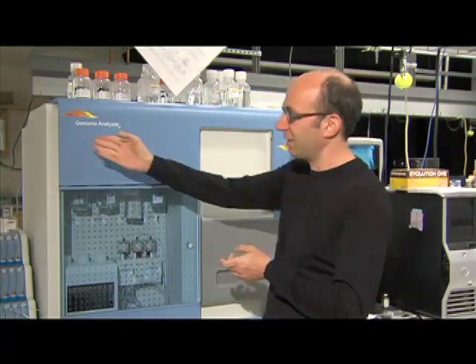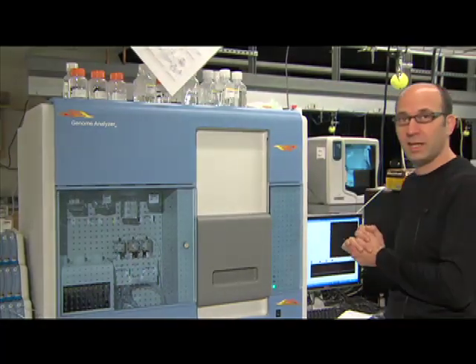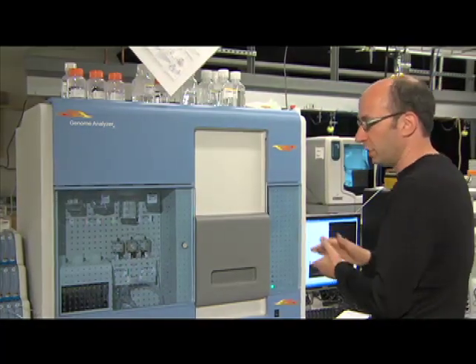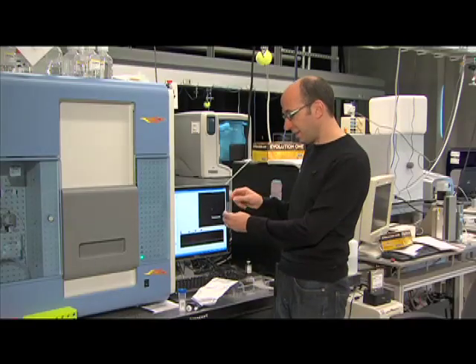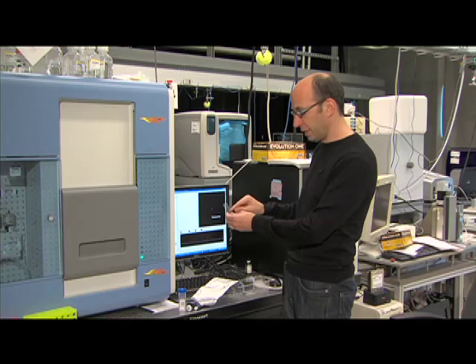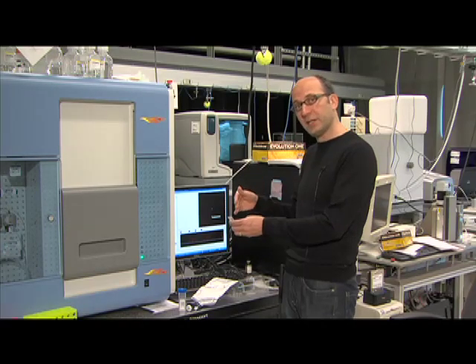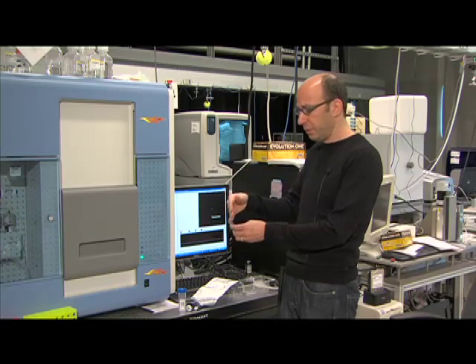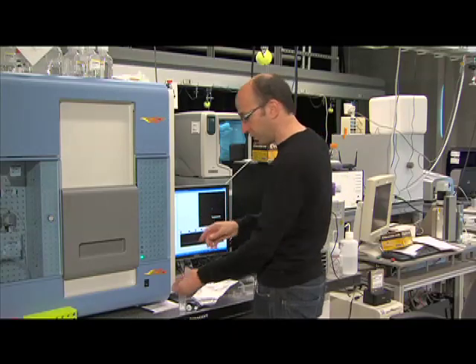And that's why they start calling these genome analyzers instead of genetic analyzers, because this is really something that can bring personal genetics to reality. So as I discussed, their clusters of DNA would be built on this slide, and then a fluorescent nucleotide, A, C, G, and T, would be put in, and the image of each of the 100 million clusters would be made.